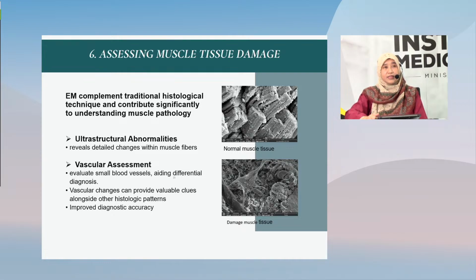It reveals detailed changes within the muscle fiber, and the detailed images also allow doctors to evaluate the small blood vessels, which aids in the differential diagnosis.